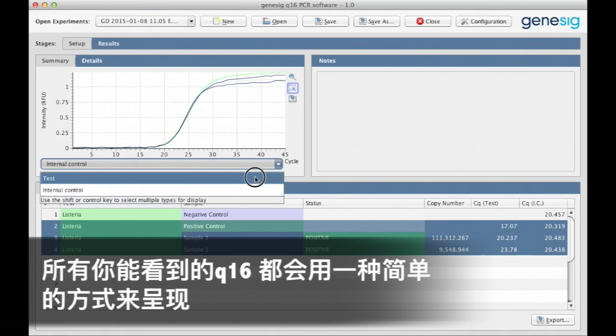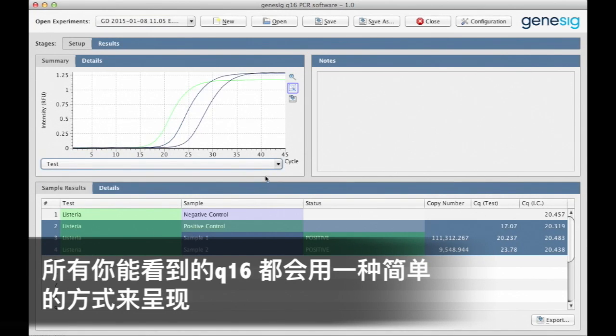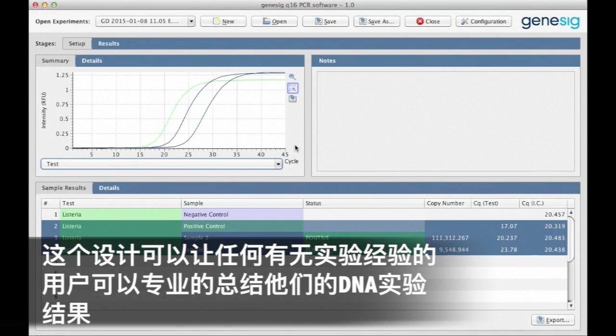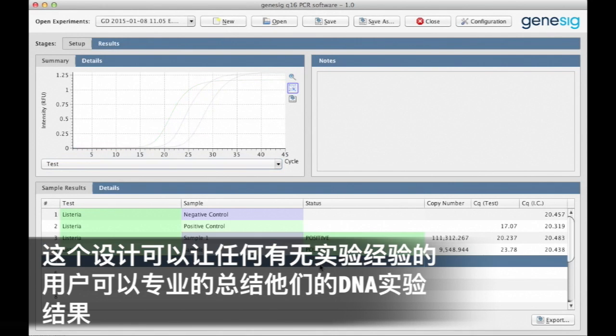So all in all, you can see that the Q16 presents your results in an incredibly simple way. It is designed to make it easy for users of any experience level to analyze their DNA like a pro.